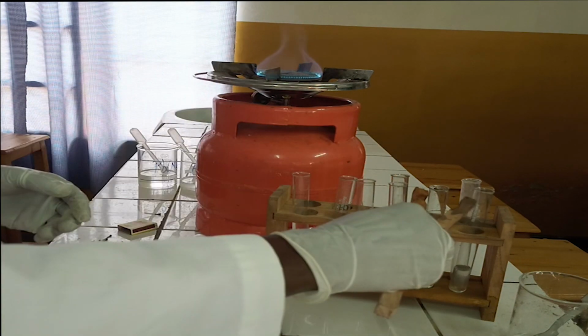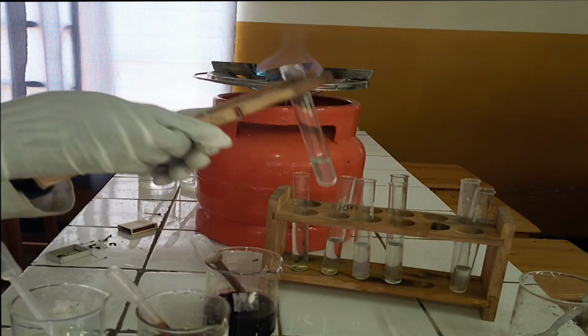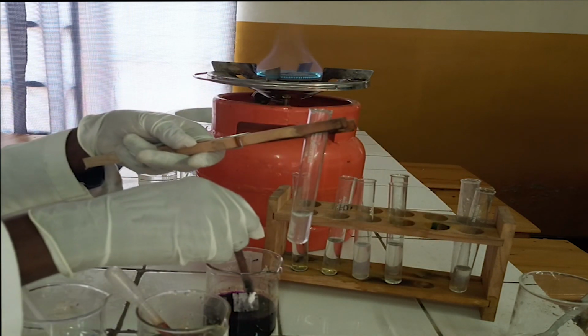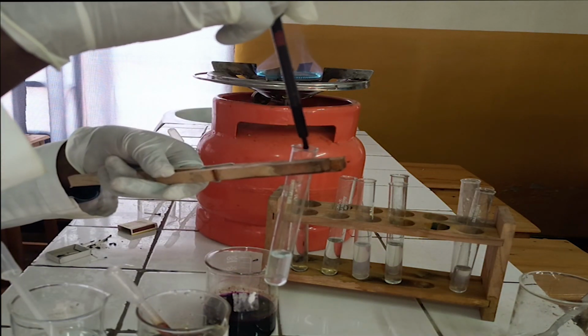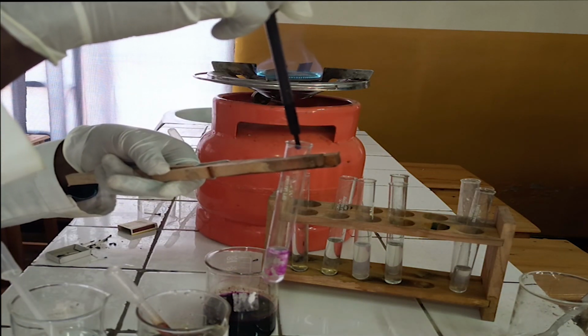Confirmatory test. First confirmatory test. To the fifth test tube, add few drops of acidified potassium permanganate solution, then heat the mixture.